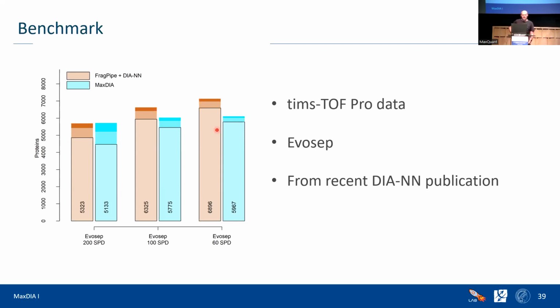Yeah, I think to some extent, yes. We have one import mode, I think, which is based on the Spectronaut format, where it's not whole peptides but transitions in the list. So this we have. It's not super well tested because internally we never use it; we always obviously use the MaxQuant libraries.